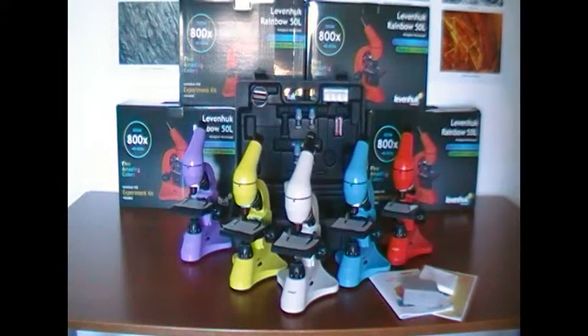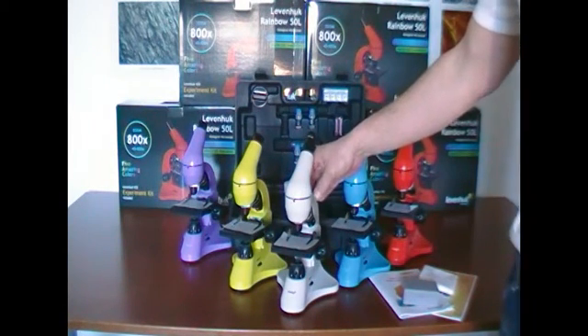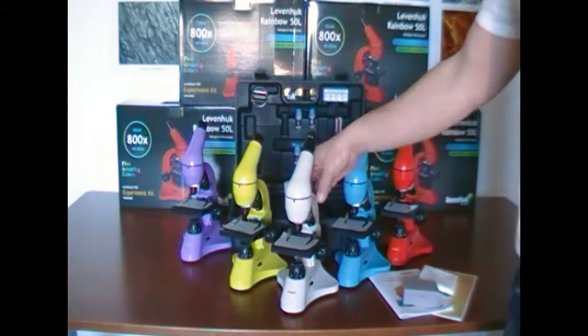Hello. I would like to introduce to you the Levenhuk Rainbow 50L microscope. It is a biological microscope offering a magnification of 40x to 800x.